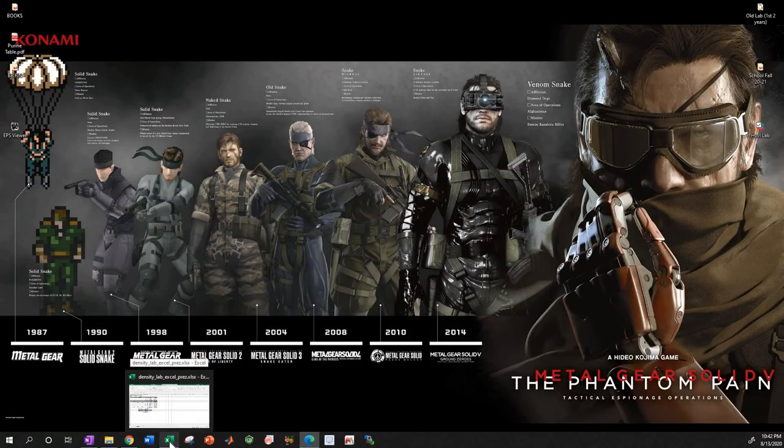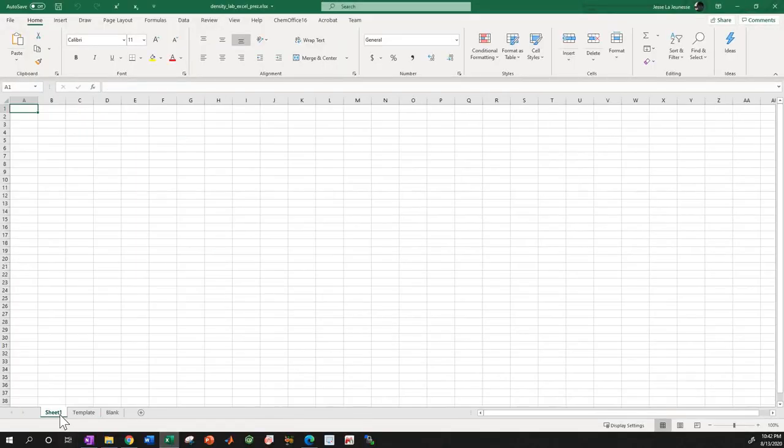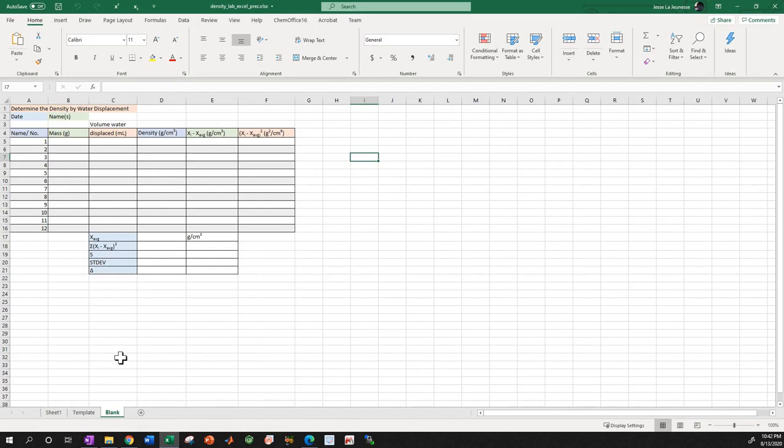Okay, so I really want to just get into this. Oh, shoot, you guys see how nerdy I am. All right, there we go. So, we don't want to see that. That's the filled out version. I got a nice blank one for us, and we're going to fill it out together. This is going to follow along with the grid of the one in your lab manual.